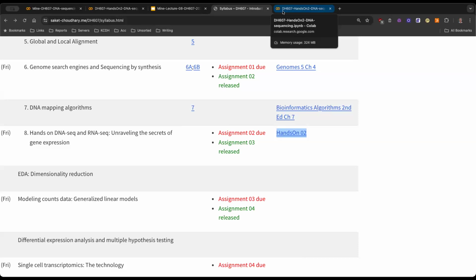All of you ideally should be able to get through to the end of this code without running into any issues. It should be reproducible, something that all of you will be able to do, and I believe all of you will learn something.